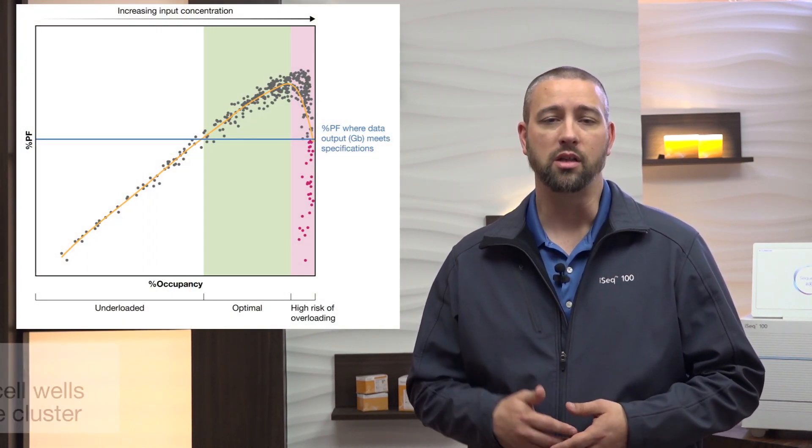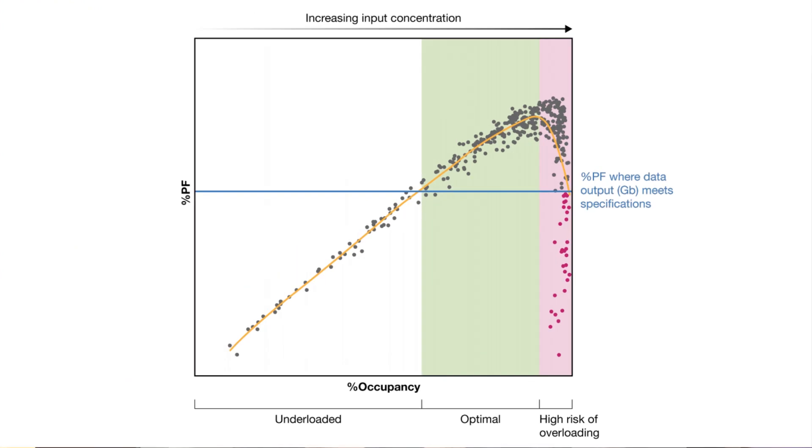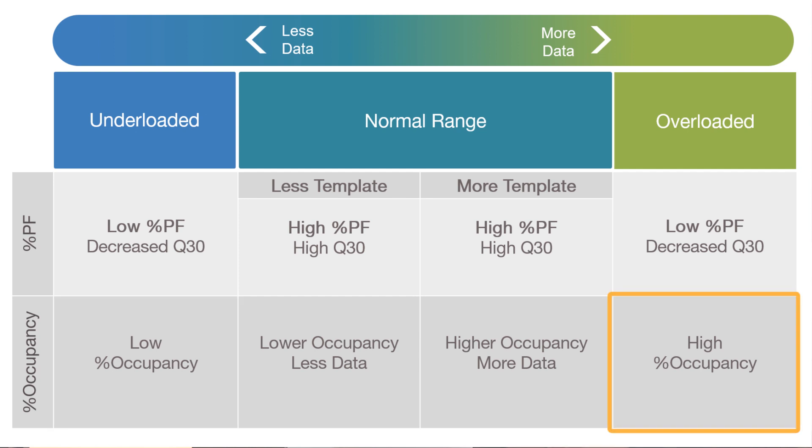Let's highlight a common troubleshooting effort for next-generation sequencing — optimizing loading concentration. When an iSeq 100 run generates a lower-than-expected percent of clusters passing filter, and thus a lower-than-desired yield, the loading concentration likely needs to be adjusted. In this chart, you can see quality metrics from many iSeq 100 runs. The percent occupancy is on the x-axis, and the percent of clusters passing filter on the y-axis. Sequencing runs showing lower-than-expected percent passing filter and thus reduced output can also have either high or low percent occupancy — high being above 95% and low being below 60%. The optimal percent occupancy is about 90%, which yields the optimal percent passing filter and therefore the optimal output for your sequencing run. By reviewing these two metrics, you can determine if the run was loaded with a DNA library concentration that was too low, leading to lower percent occupancy, or too high, leading to higher percent occupancy, and then adjust accordingly.